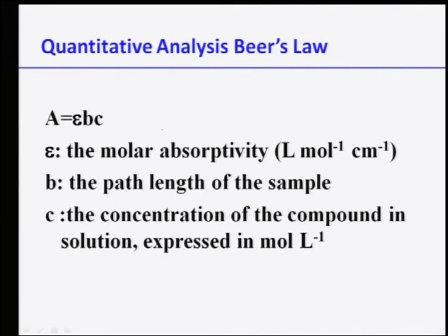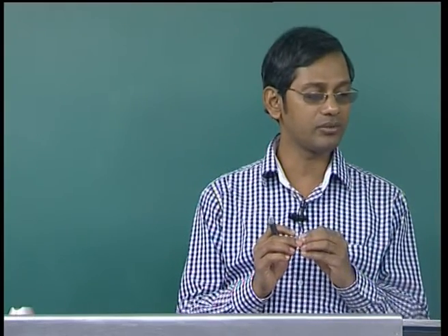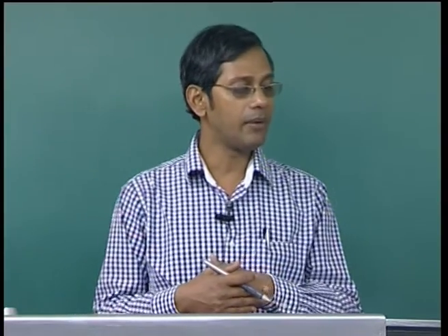Well, now these are all qualitative discussions. Now what we can do is use Beer's law to quantify different kinds of absorption. As you know, when a molecule is subjected to light, or a particular wavelength of light is passing through a solution, the molecules can undergo the transitions which I have shown you. And obviously some light is absorbed, used to promote this kind of transition. So an optical spectrometer basically records the wavelengths at which the absorption happens.